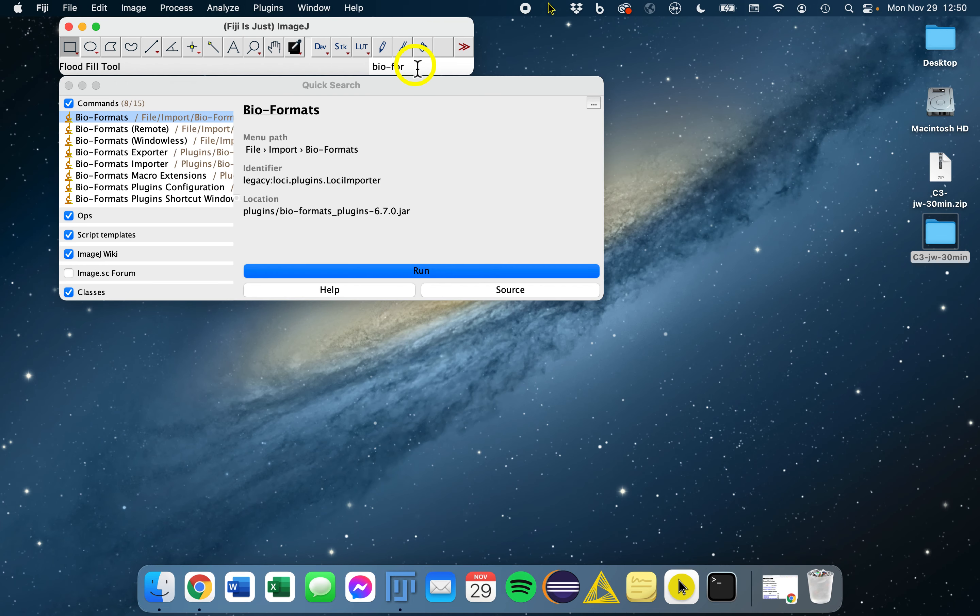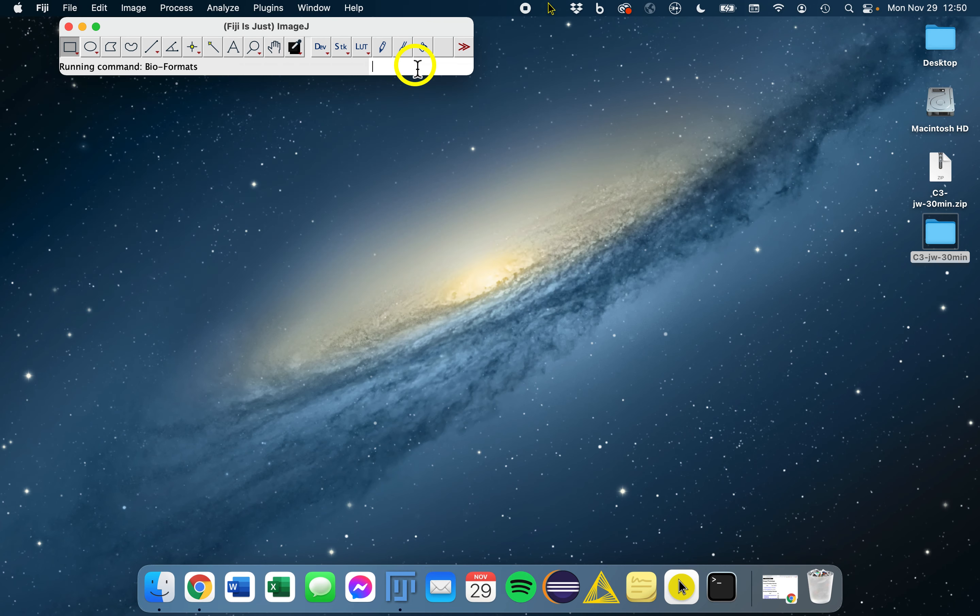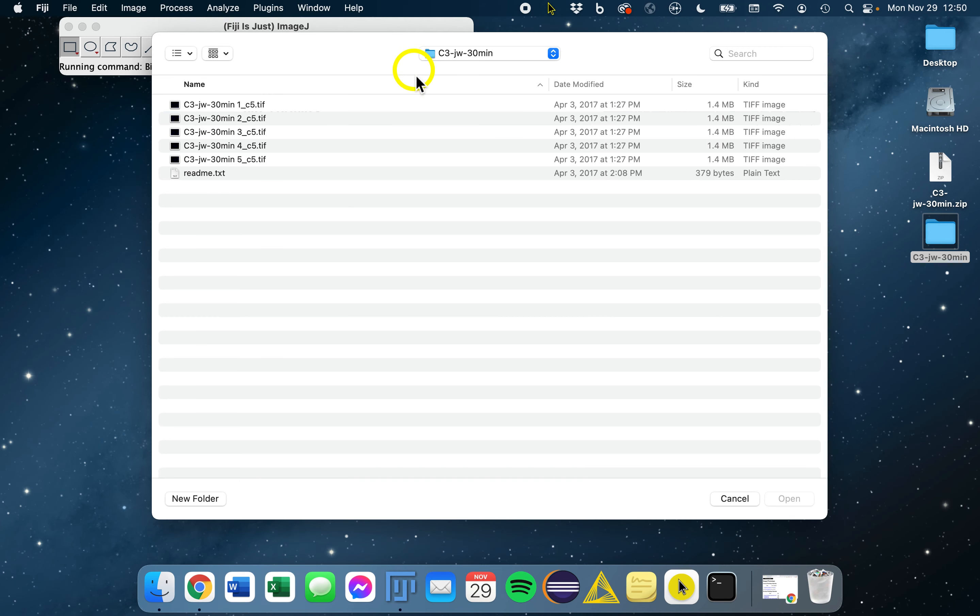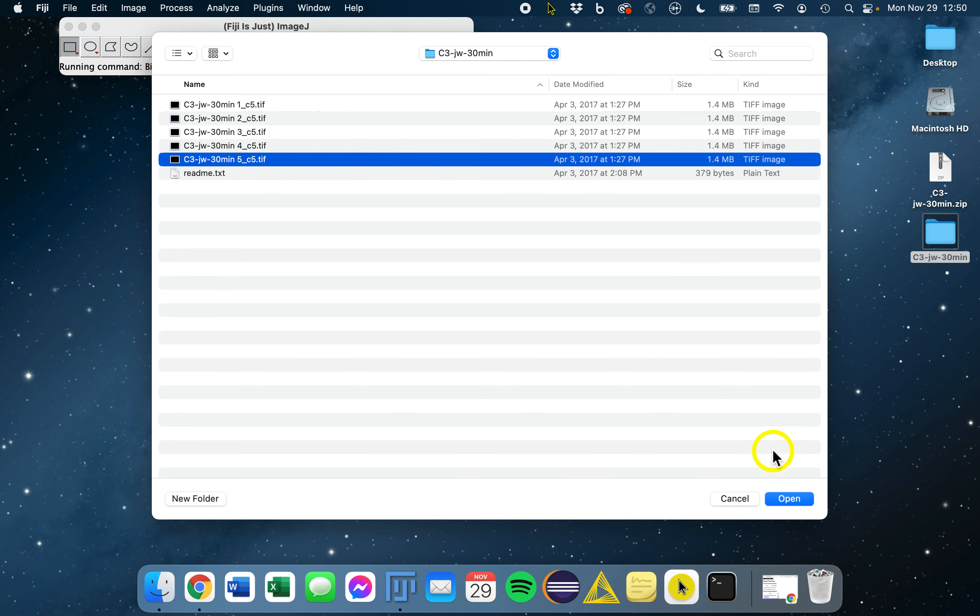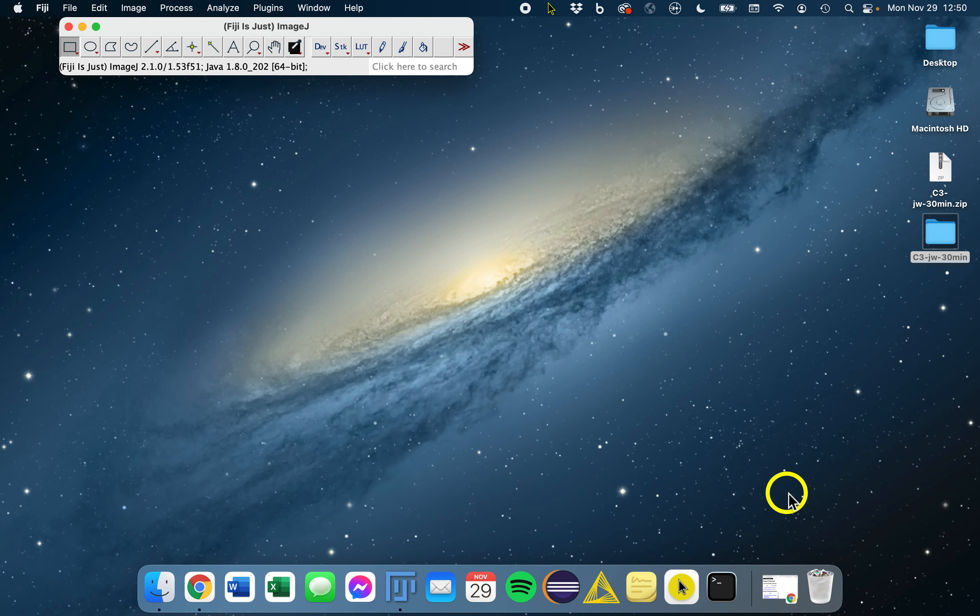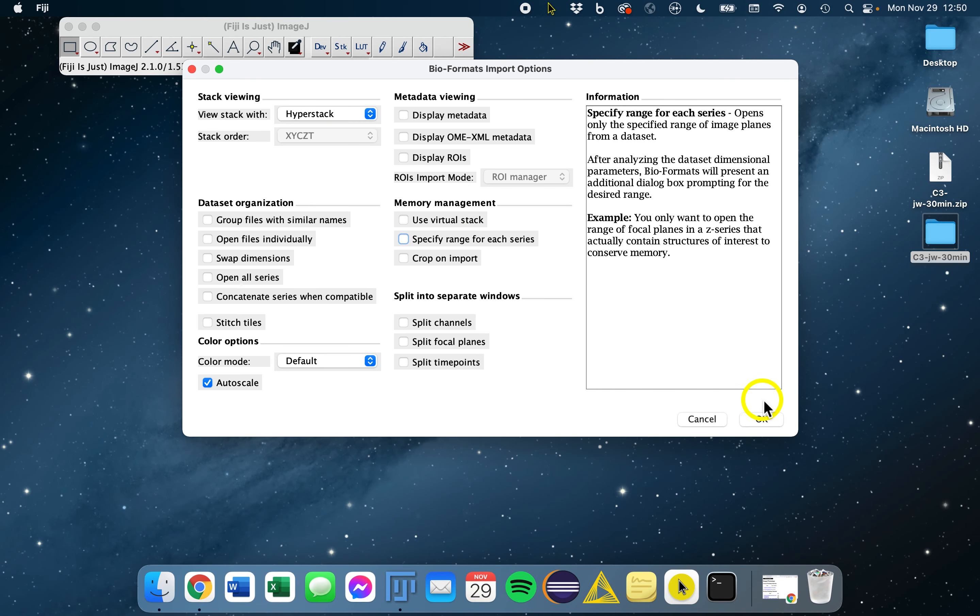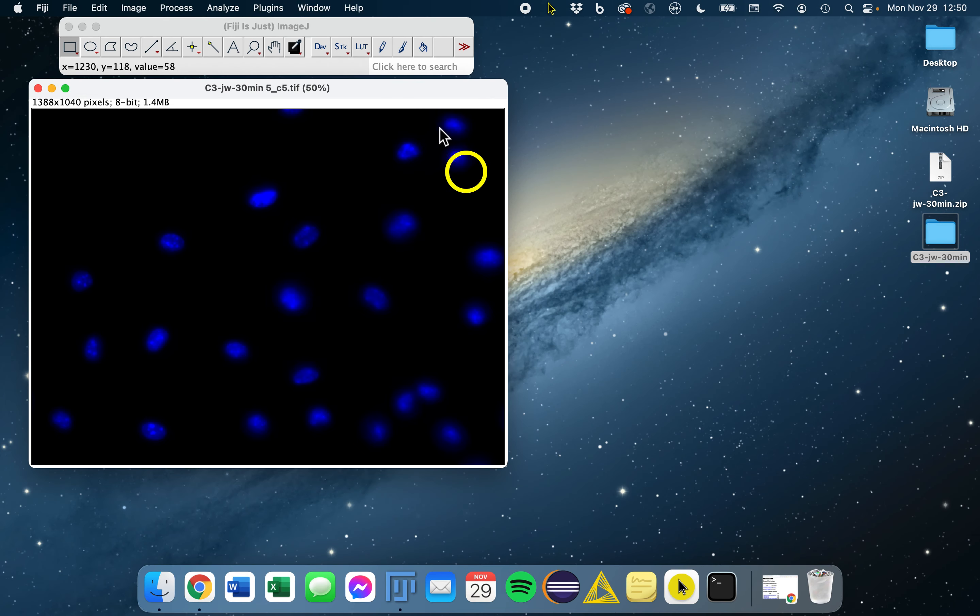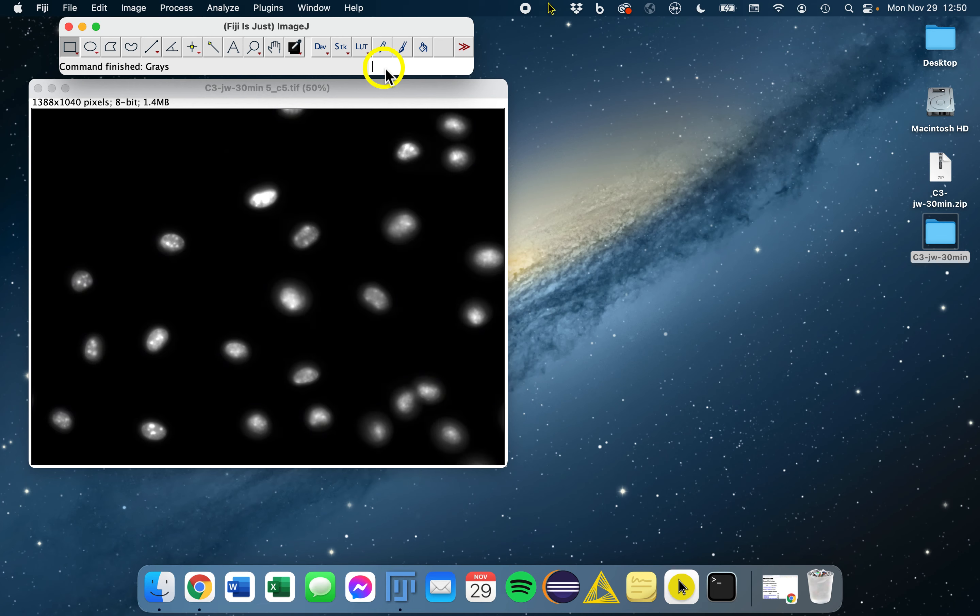So you go to Fiji, open with bioformats, and we'll actually be using the fifth image, 5 underscore C5. And then we will just change the color to grayscale. It's easier for our eyes to see differences in the image.